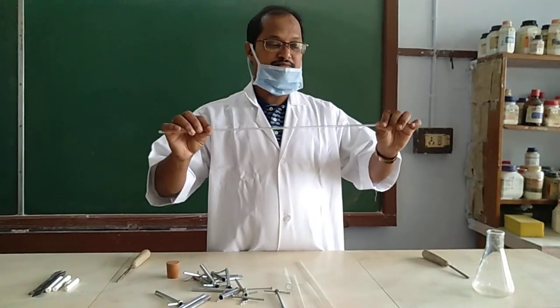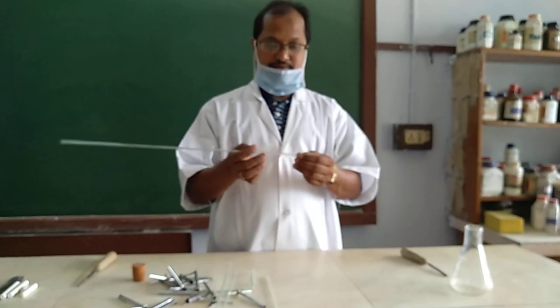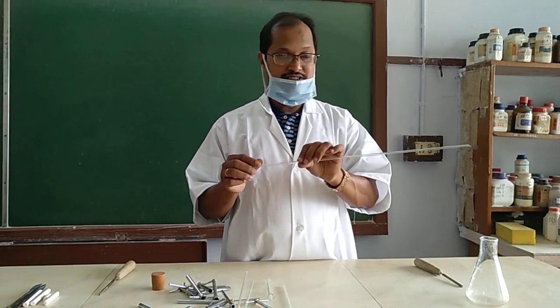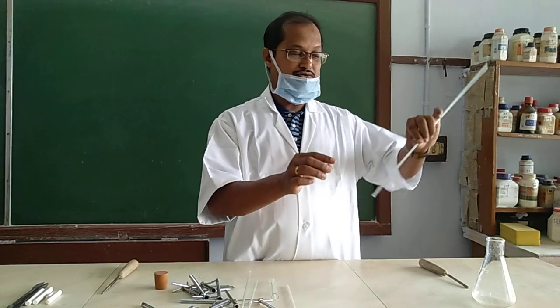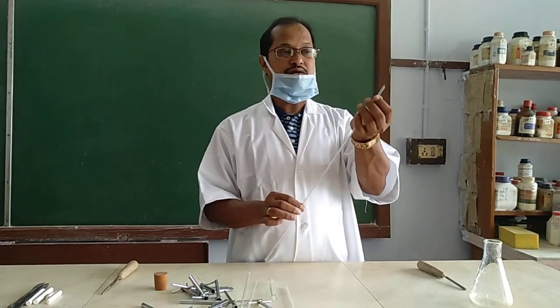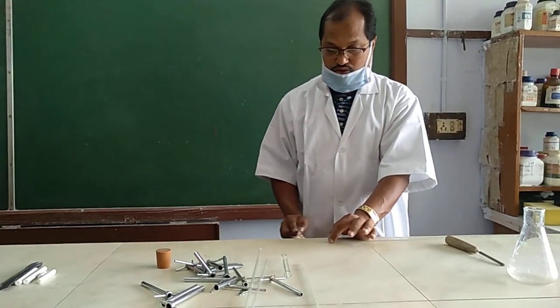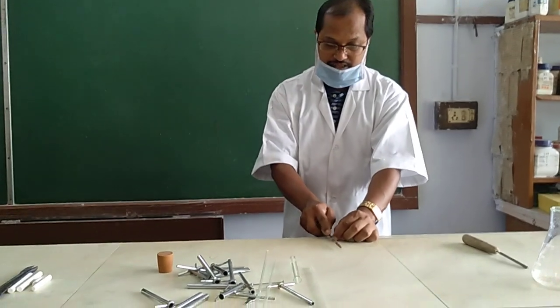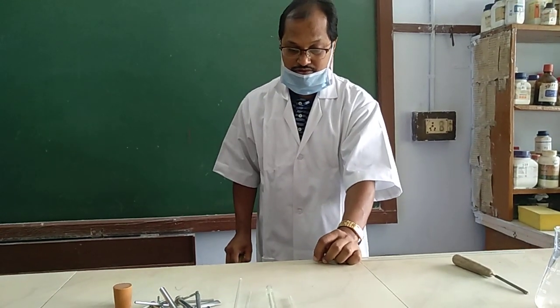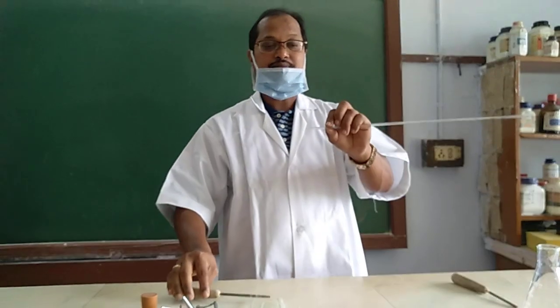First, make a measurement of the glass tube and see what you need. You need to cut the glass tube as per the requirement. Suppose this part I want to bend and use as the mouthpiece. First, you have to make it in a proper shape. Take the file this way, then mark the glass tube like this. Give one mark through the file, and in the opposite direction make the same mark.